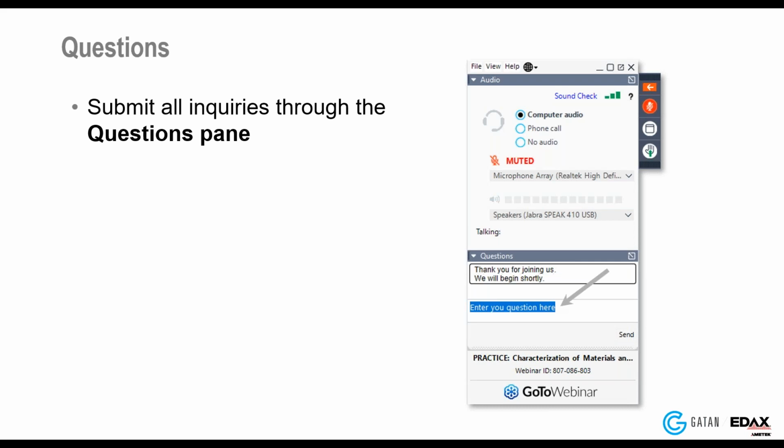So when changing the accelerating voltage, the magnification and image rotation, and a number of other different things change within the electron microscope. So that's something that the software we're developing for CIPHER will allow users to really eliminate, that kind of disparity between the information from the 2 sequentially captured data sets. So yeah, I hope that answers the question.